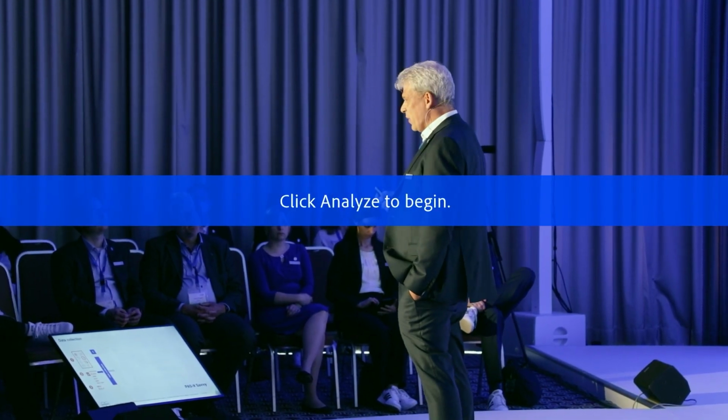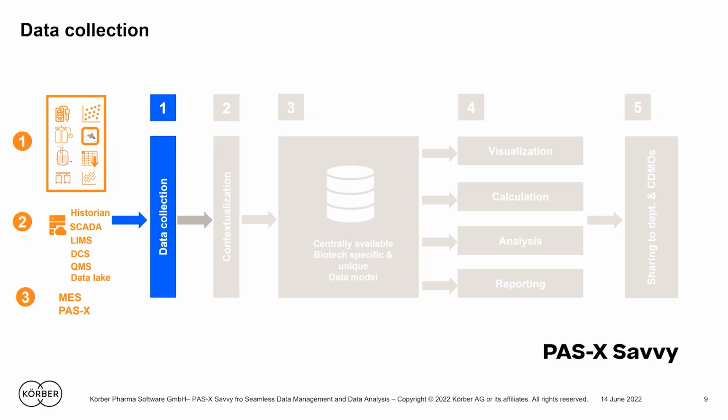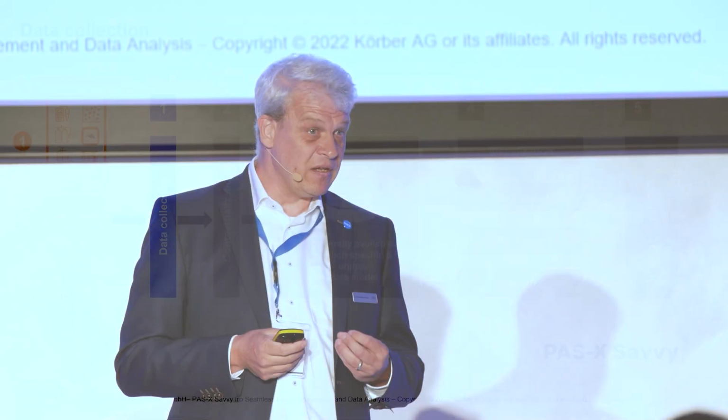But also when you look at the number 1, it's also connecting to individual devices, which may have also in development, right? The chromatography system, the plate reader, the cytometer, the bioreactor, whatever, all these elements, you can connect them individually. I will jump over that, how we do that. It's mainly based on APIs, REST APIs. It's based on OPC UA, of course, on data crawlers, etc. If you have enough driving force, it's always possible to connect it. Okay, normally we can always connect that. It's not the point. Okay, it's about the value which finally drives it.